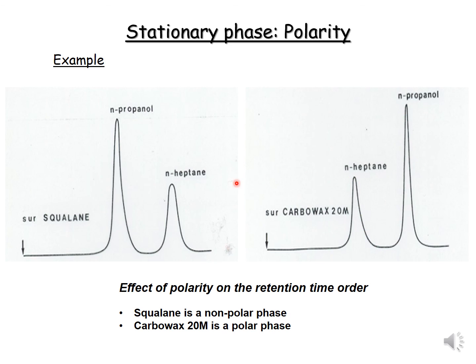And then you can imagine that, theoretically, with the polarity of your compounds and the polarity of the stationary phases, we can imagine the order of separation of your compounds. And that's important to know.